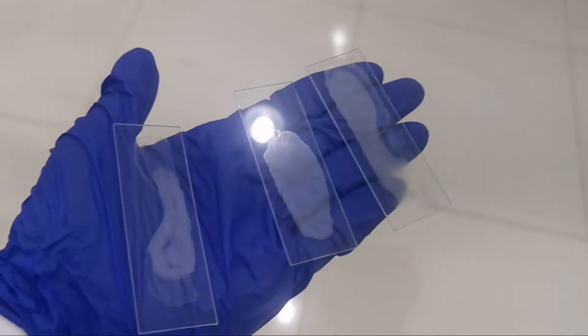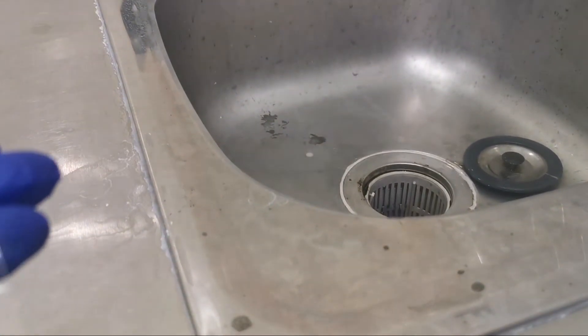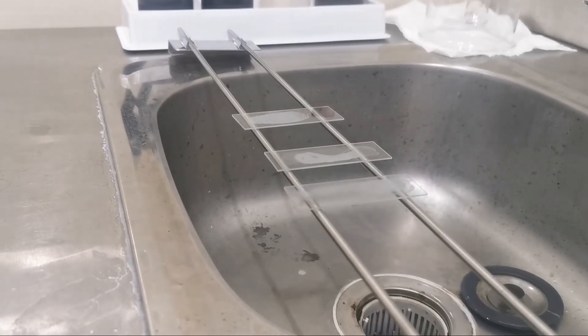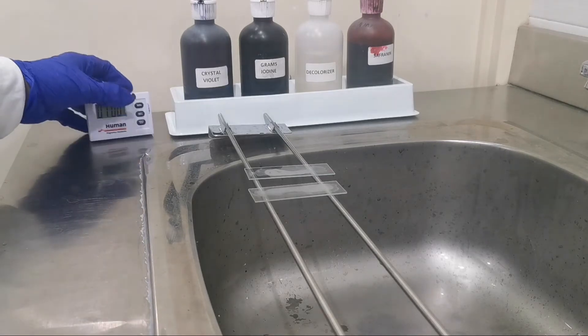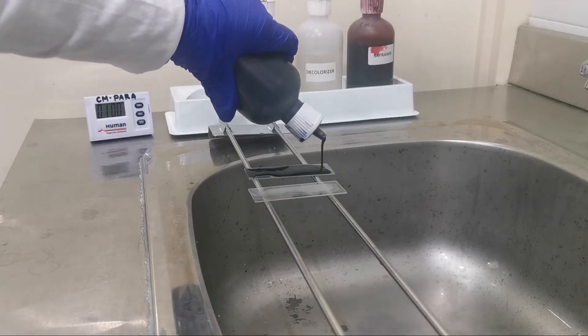Now we will do the gram stain procedure. I didn't put a label because this is just an example and not a real patient — but on an actual basis, you should always label the slide. I prepared three slides but will only stain two: the one on the right had heat fixation done, and the one on the left did not. Let's see the difference between the two.